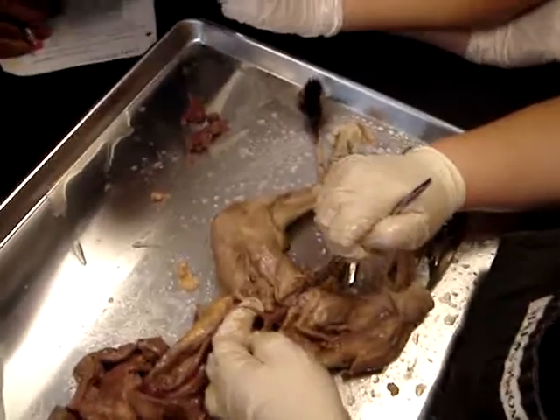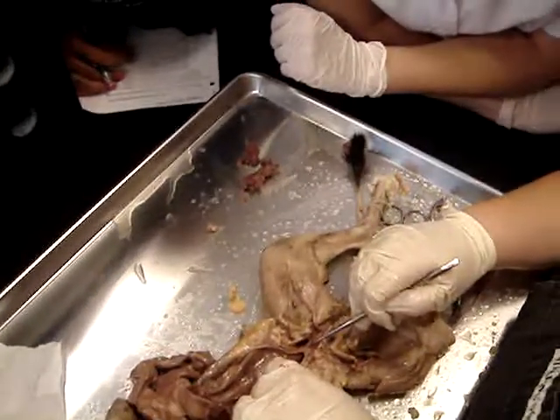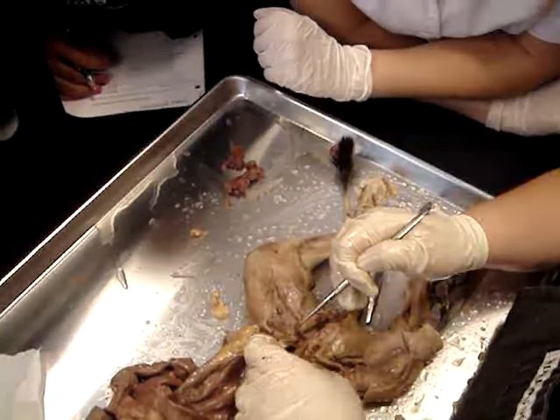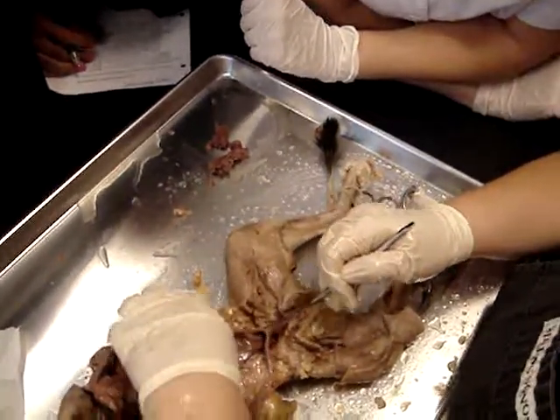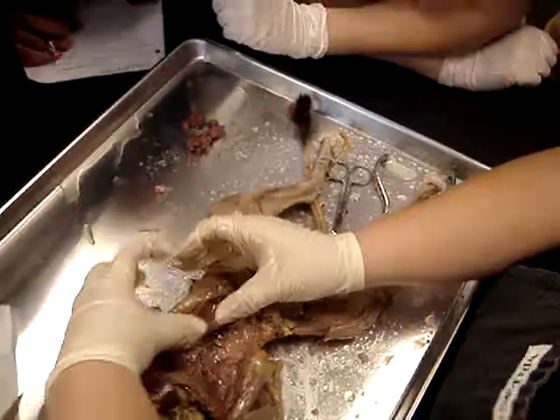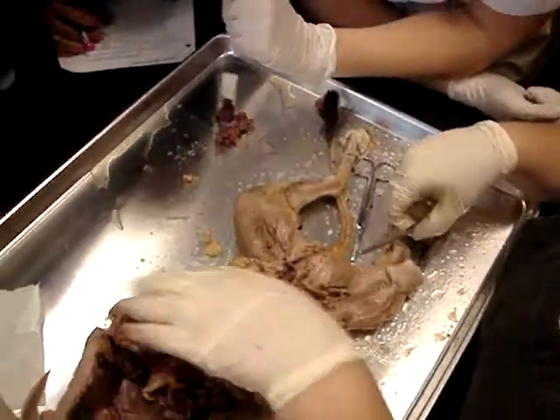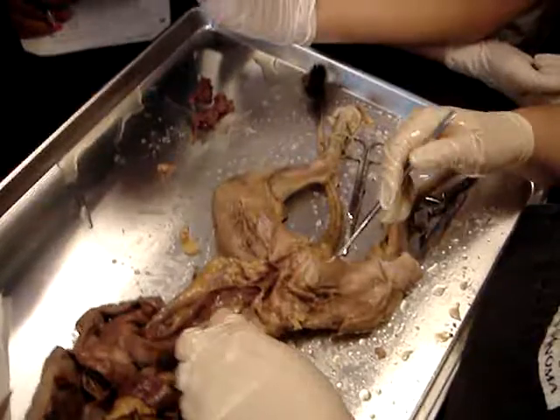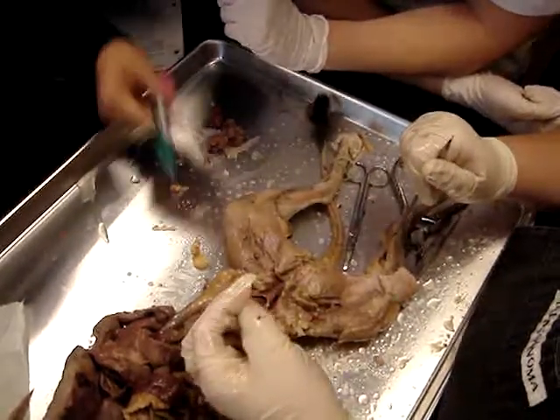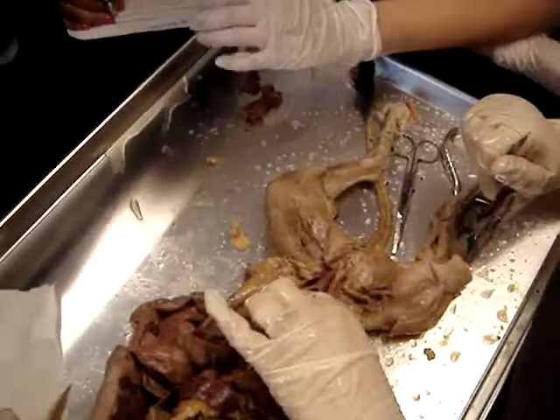So wait, that expands to the size of a balloon? No, the vagina or the uterus? The uterus. So small because she's never been pregnant. So when she's pregnant, she'll stack the babies up along the tubes. Sometimes if they only have one kitten, it's only one side. But, you know, they fill them up. The baby will grow in there, and the placentas would go inside here. Yeah. It expands a lot.